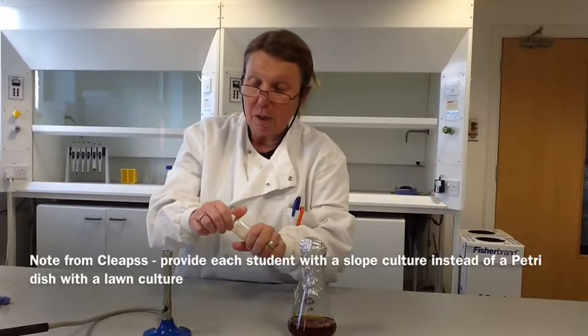A note from CLEAPSS here: they recommended to us that it's bad practice for students to ever open a Petri dish with any sort of culture growing in it. Therefore it would be better to provide each student with a slope culture in a little bottle. There's no real difference — it really just is to discourage students from ever opening a Petri dish with a culture growing in it.